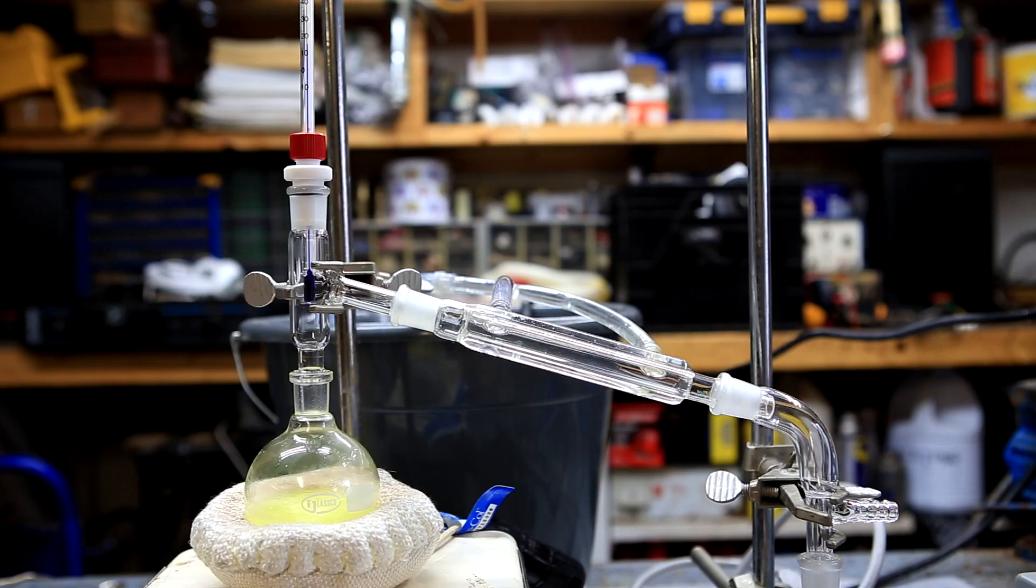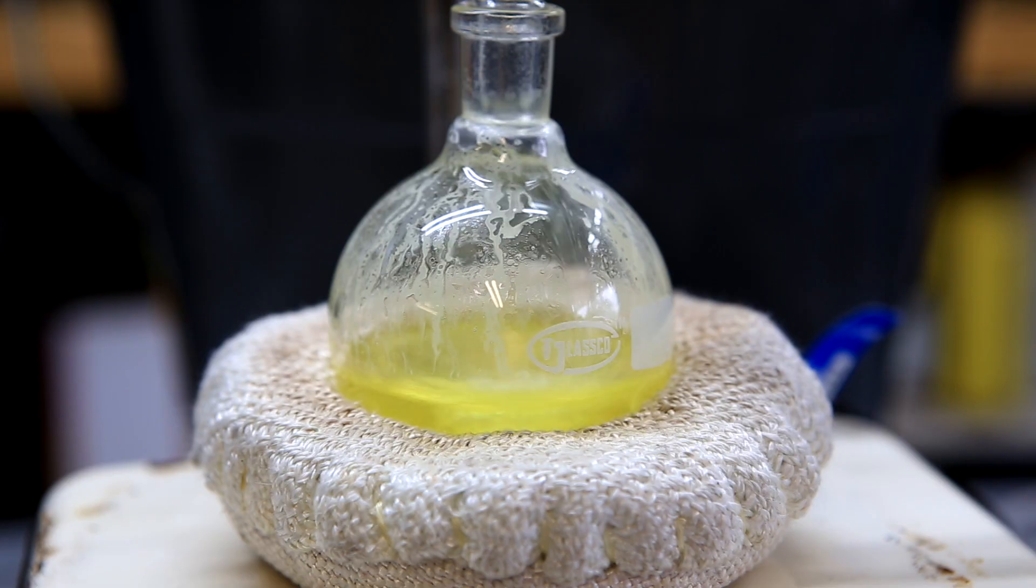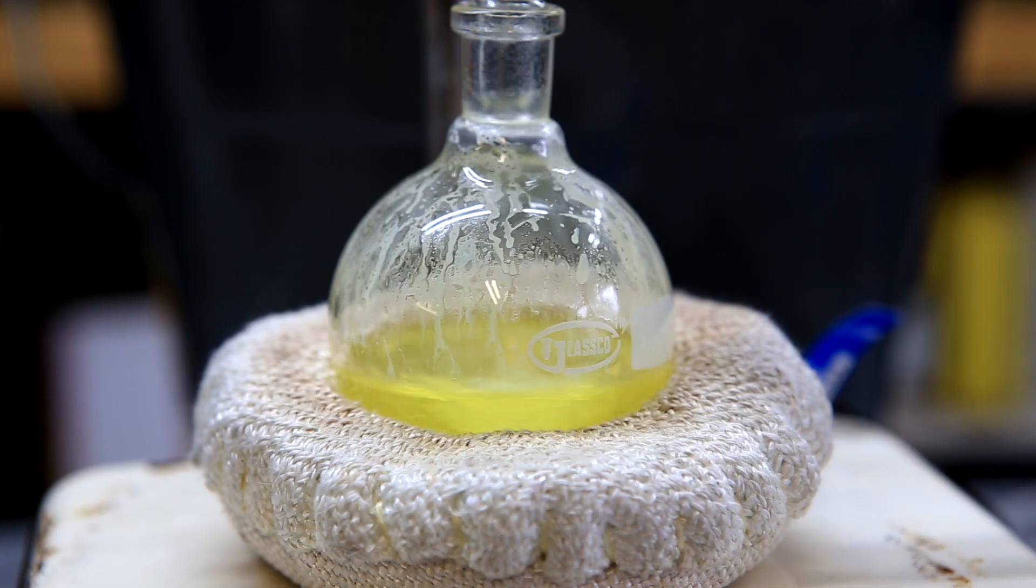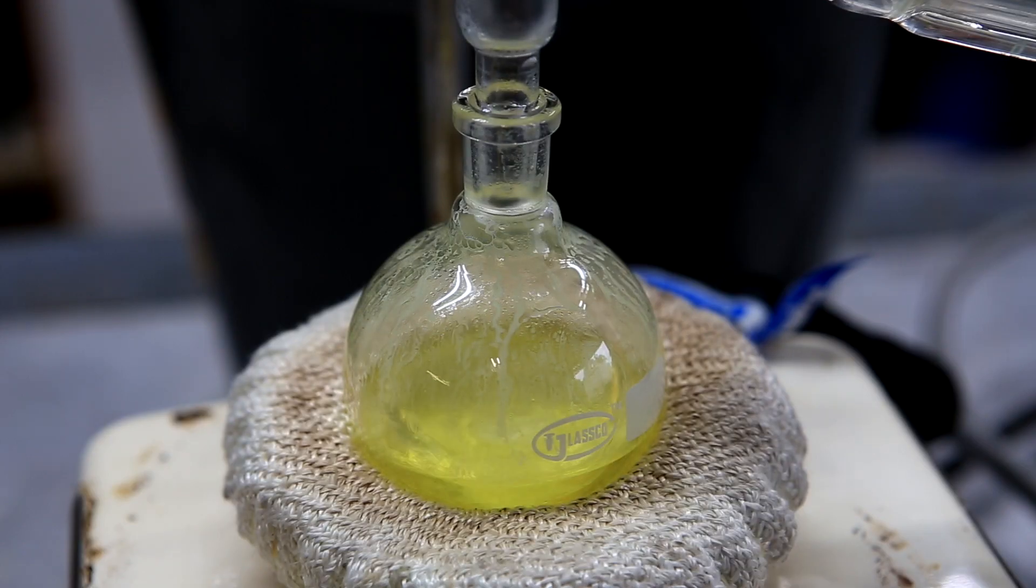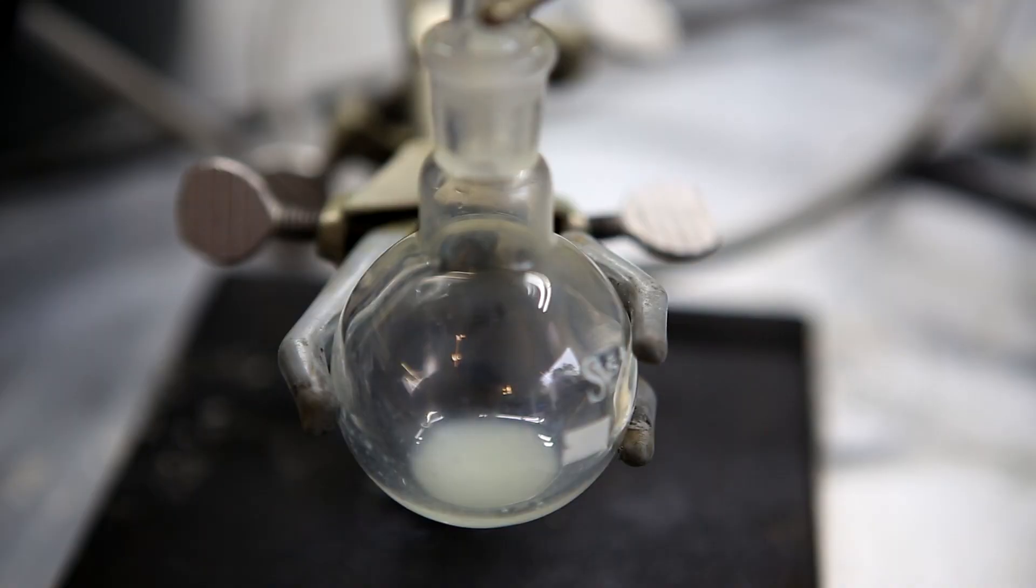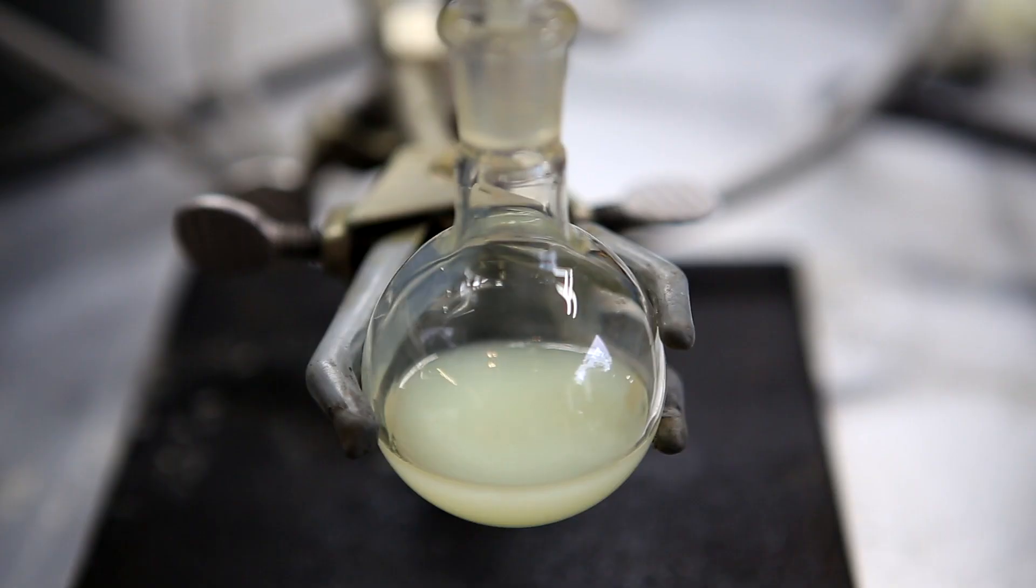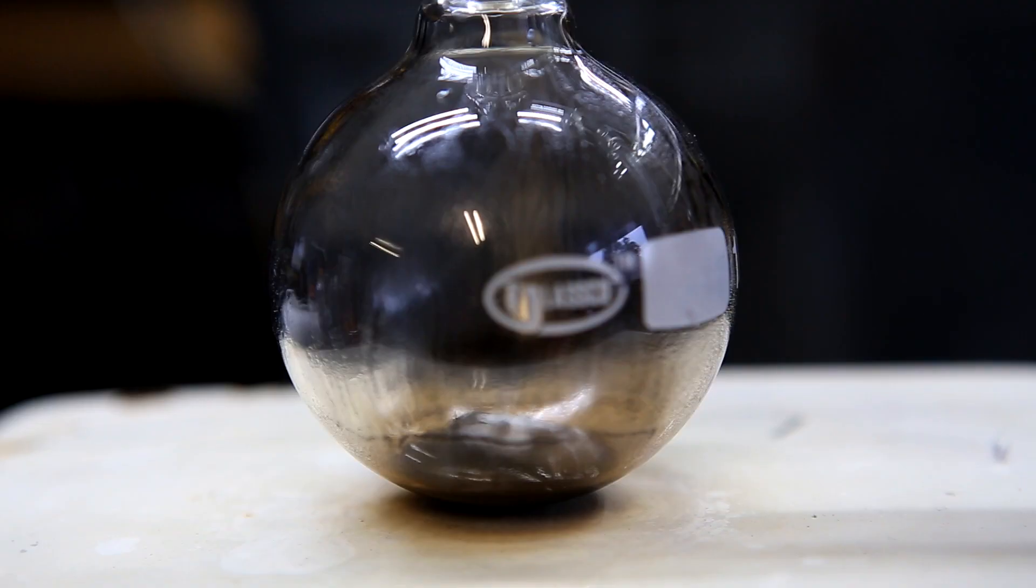The fraction that started coming over at around 208 degrees Celsius was collected. For safety reasons do not let the distillation flask get any hotter than 214 degrees Celsius. Also it's important to not distill until dryness. As the distillate came over it should be a cloudy white color because there's still water present in it. In the distillation flask we're left with a thick brown goo.